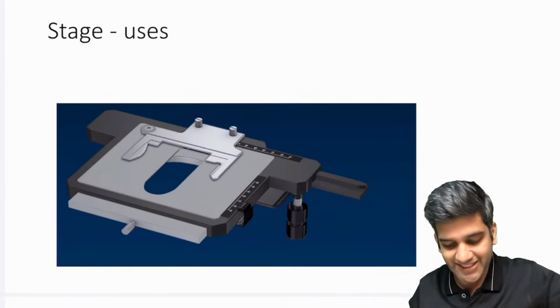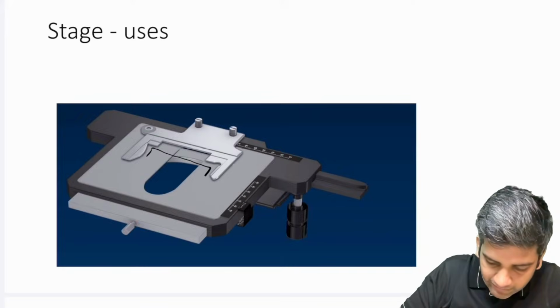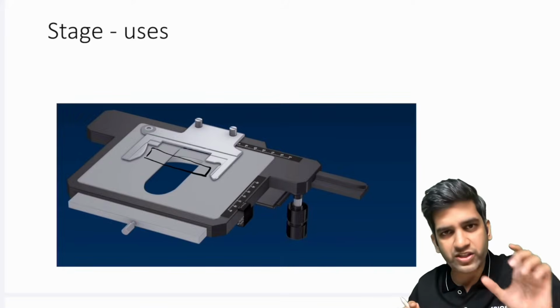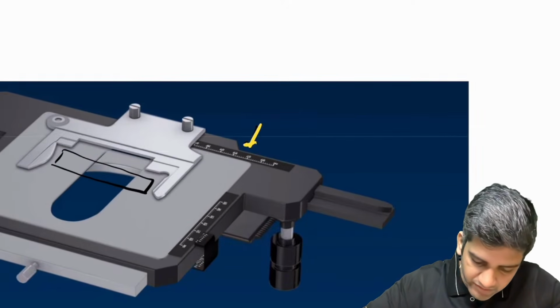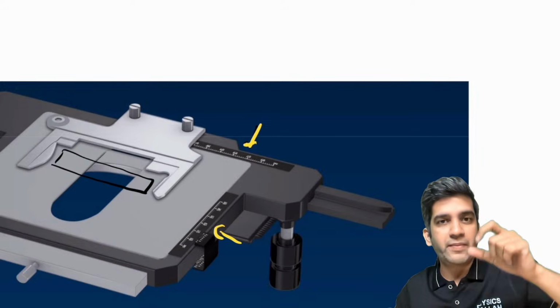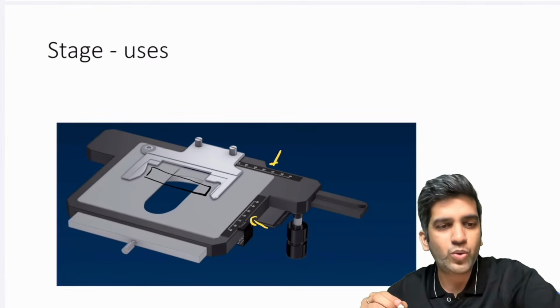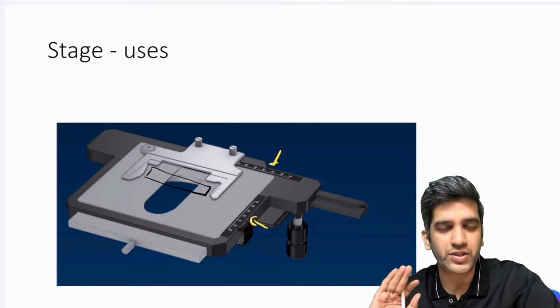Okay, the first thing is the stage. Stage use, first and foremost, we have to clip it like this. By default, you clip a slide here, it holds the slide. These are the scales which Akib said, right? Scales. You'll have measurements. The use cases, now, though you are a bit young into your second year, I am sure you will try to answer this question.